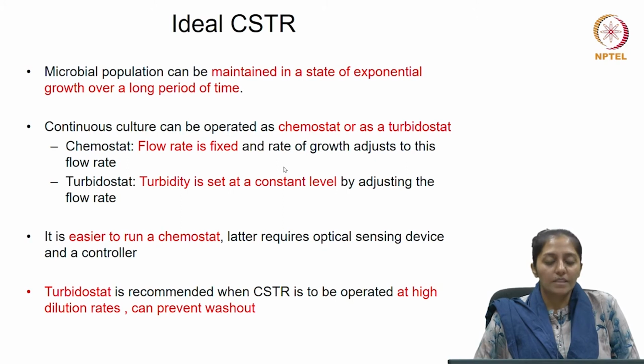So it is much easier to run a chemostat because a turbidostat would require an optical sensing device and a controller to control the flow rates.